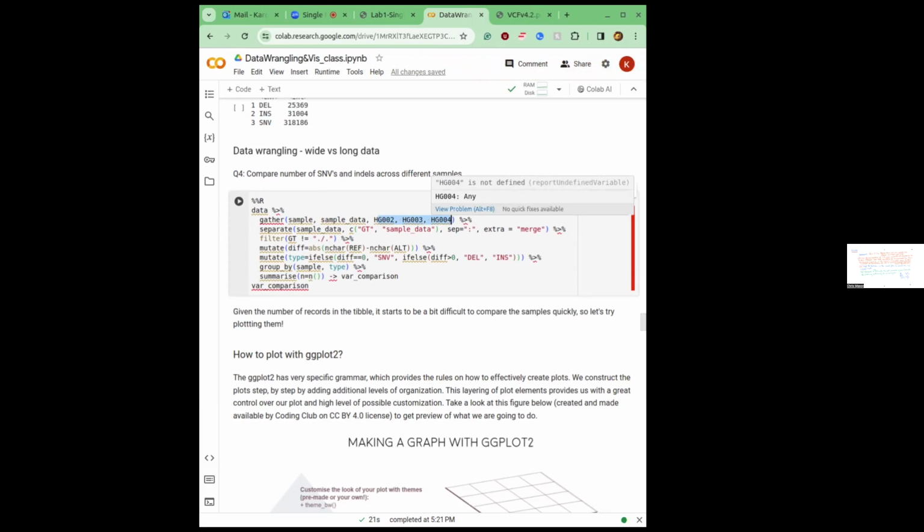Why would I want to do that? If anybody is familiar with ggplot later, you will know that basically I'm creating a new variable for each row. And then I can just specify, oh, put on axis X this particular variable, and on axis Y the other thing, right? But also for parsing, it's very helpful. There are simpler examples in the workshop that is linked, that I pointed out before. If somebody has any problems, you should take a look there. There's also a bunch of materials at the bottom linked for ggplot and for tidyverse. And of course, you can just email me and I will try to help you.